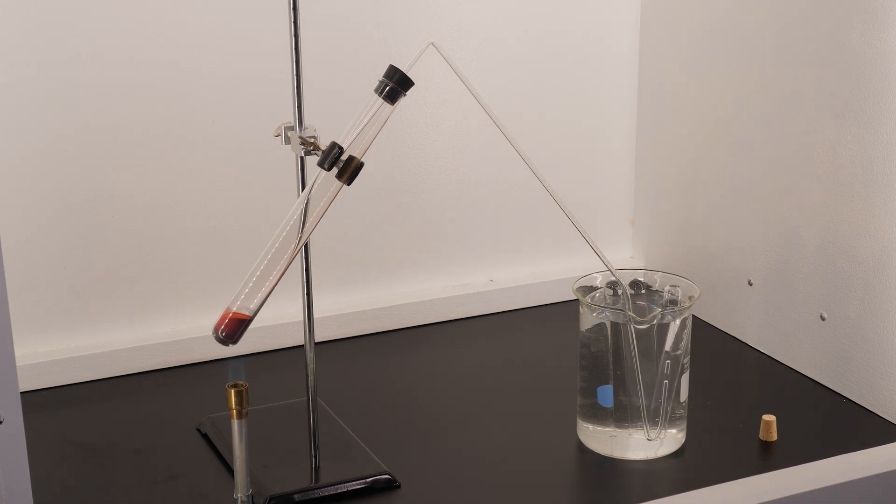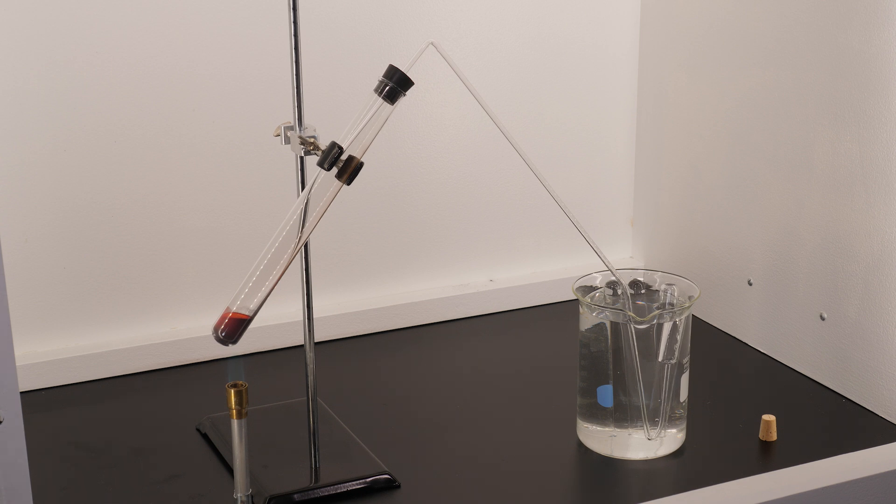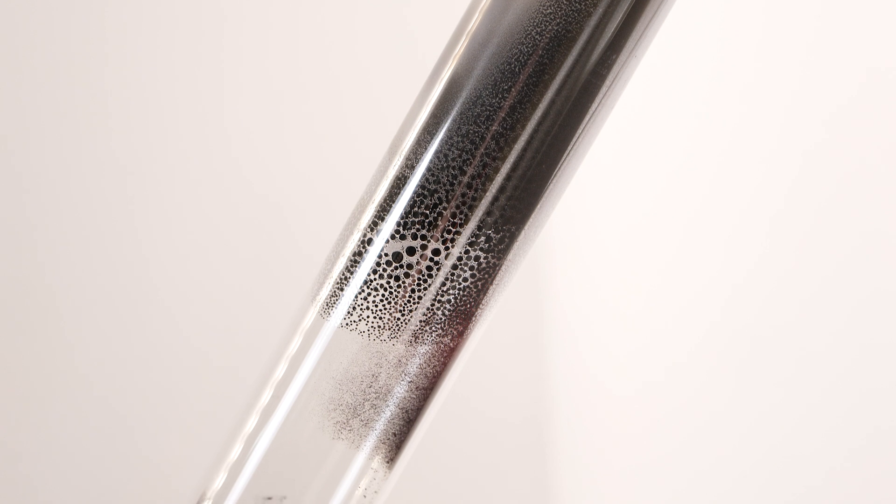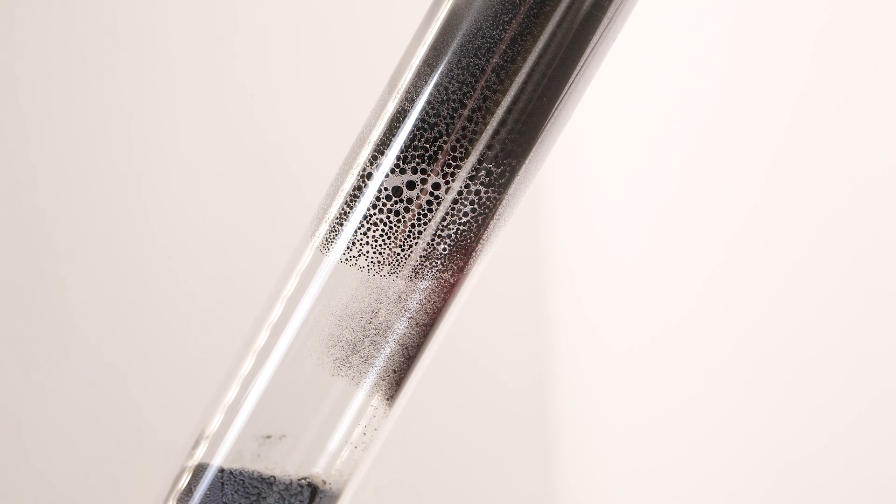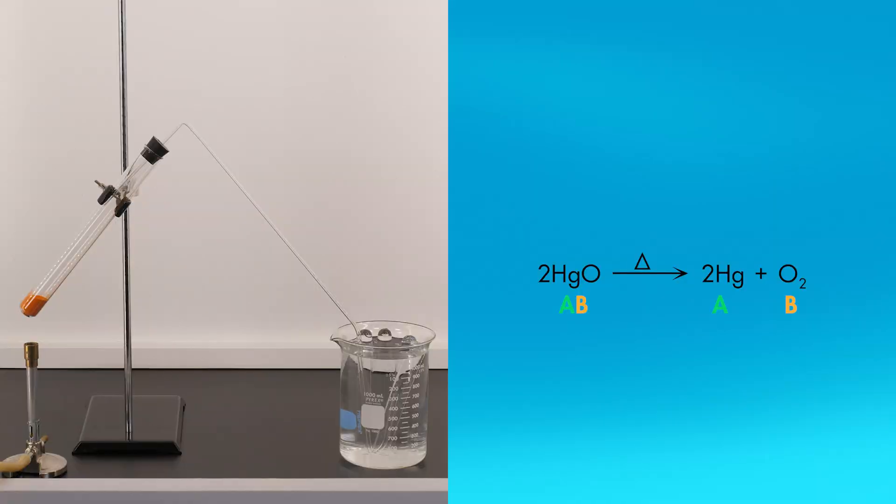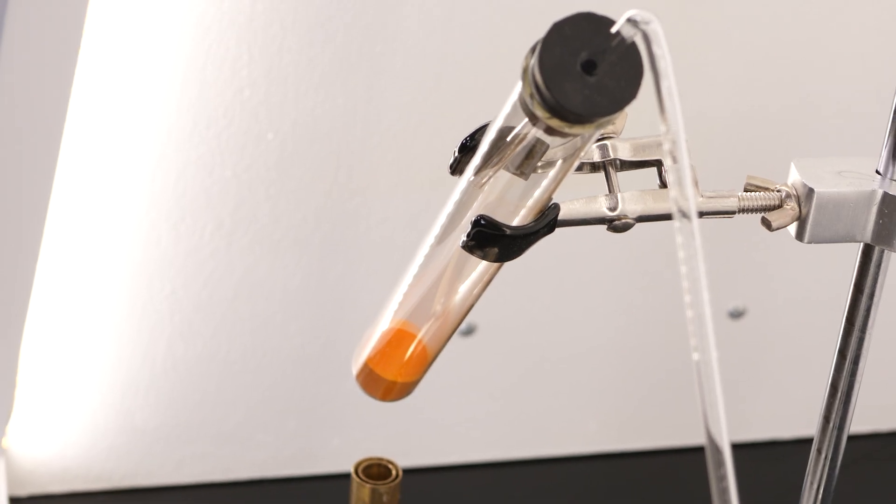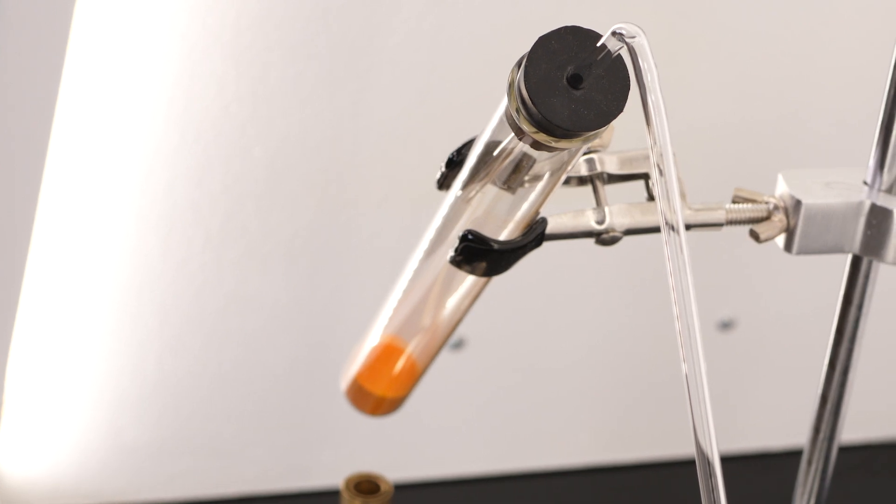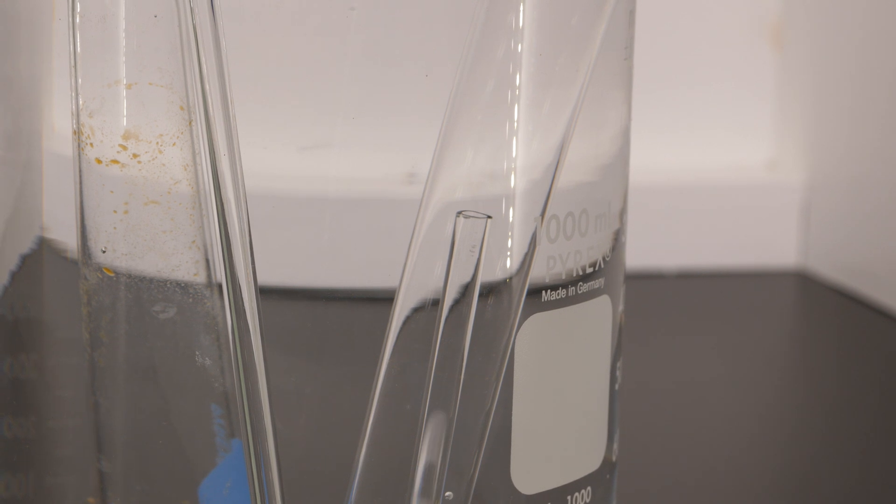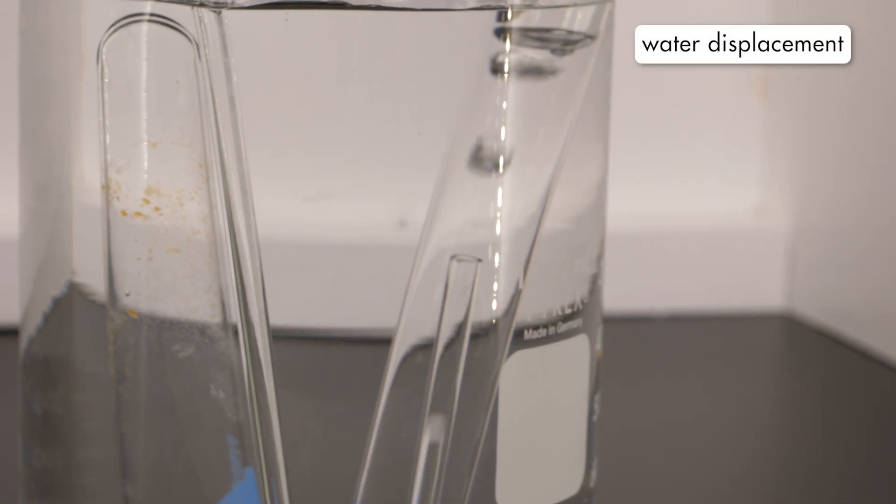Because mercury vapor is toxic, we work under the fume hood to avoid inhaling the vapor. As the mercury vapor cools, it condenses to form droplets of liquid mercury. The second product of the thermal decomposition of mercury(II) oxide is oxygen gas. As the oxygen is released, it passes through this tube. Here, we are collecting the oxygen by water displacement.